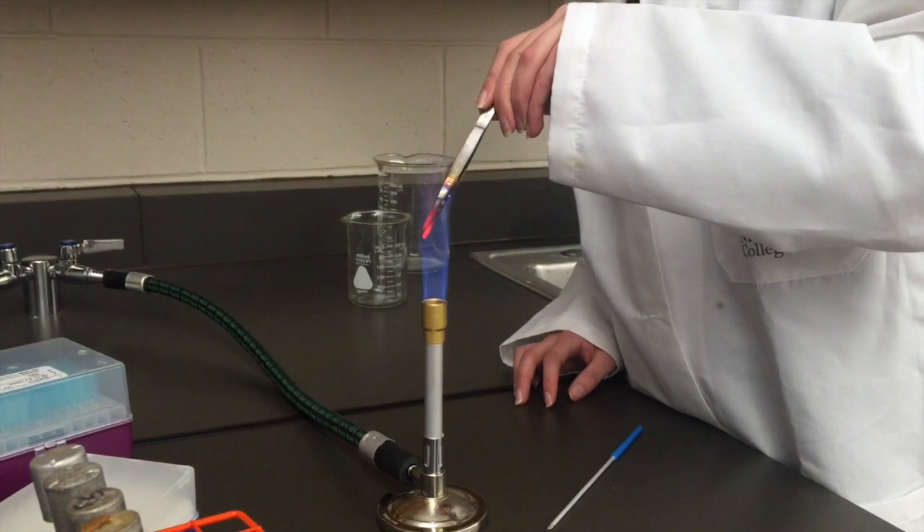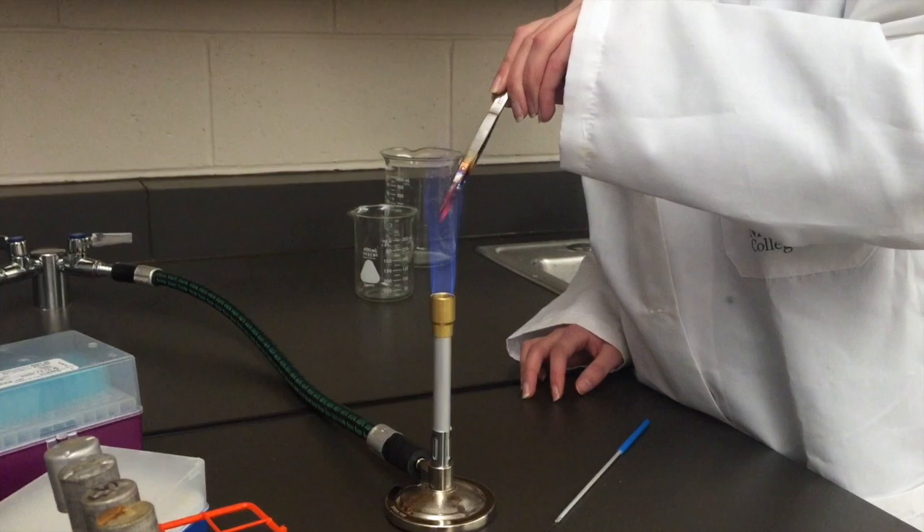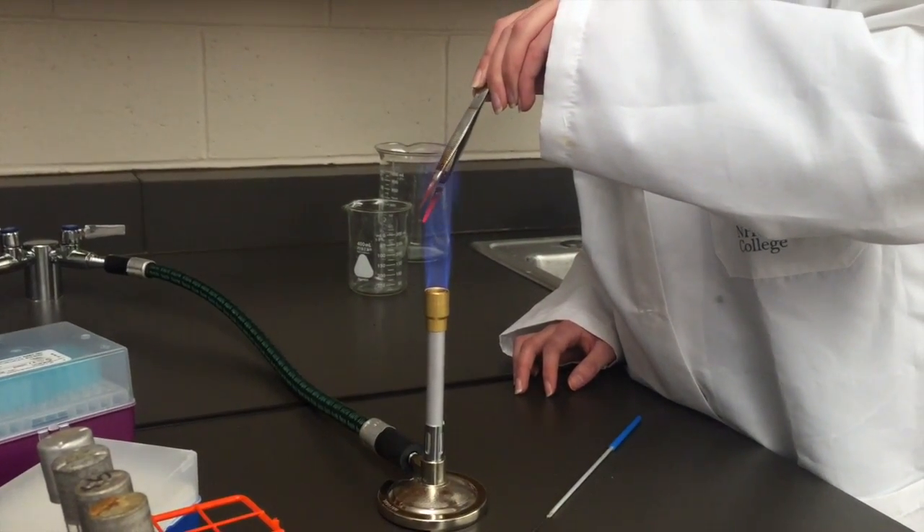We also want to ensure that the bacteria that are evolving in one tube are not transferred into a different evolution tube. Therefore, we need to repeat the sterilization process between replicates.